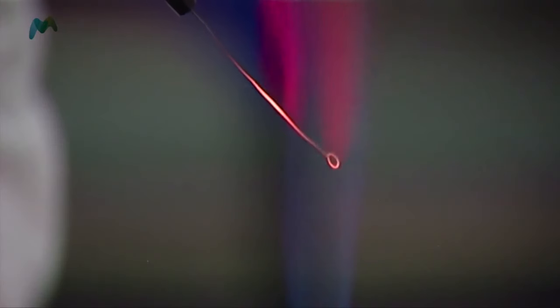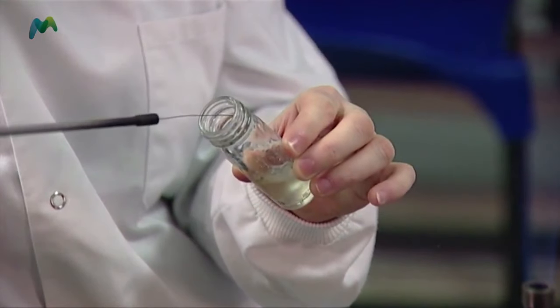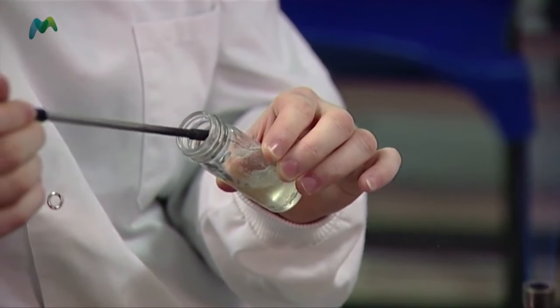I check that the lid is loose on my bottle, then I start off by flaming my loop, making sure it gets nice and hot. I flame the neck of the bottle, drag my loop down into the culture to pick up a loopful, then flame the neck again and put the lid back on.